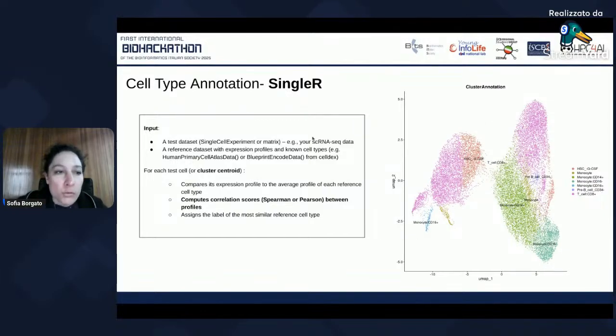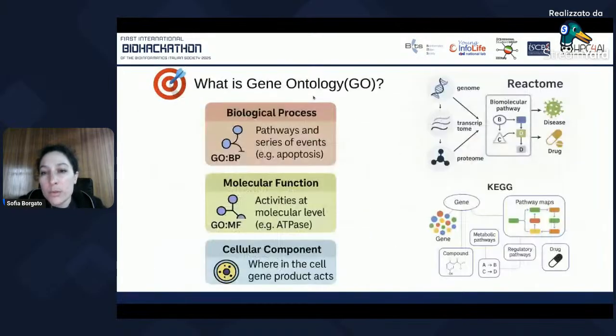Let's say that doing only cell type annotation is not enough in most cases. In most cases, you need more specific analysis. And also you need some kind of previous experience on the dataset, so some information related to the experiment, why the dataset has been collected, and which kind of process you expect to see in the dataset.